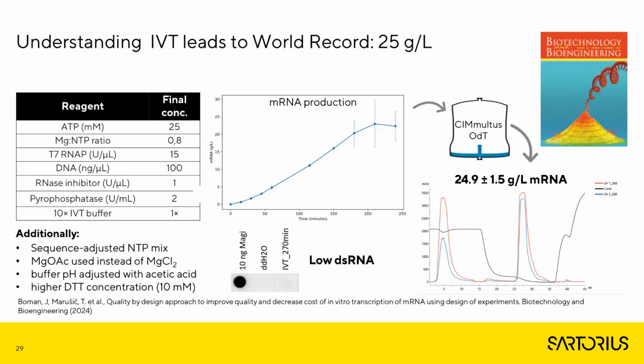But we did the reaction not to make so much mRNA, but rather to prove that, as is described in the paper with the reference below, that we really understand the drivers of IVT yield. Please follow the story or reach out if you'd like to learn more. The message is it's possible to really track what are the important parameters in the IVT reaction. It's possible to push the yields to levels that have previously not been considered possible.